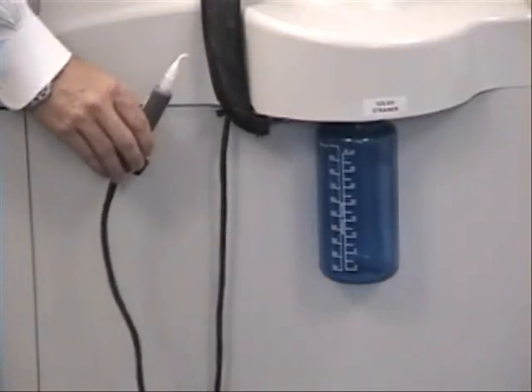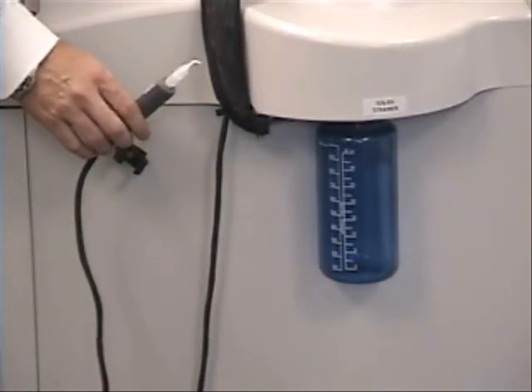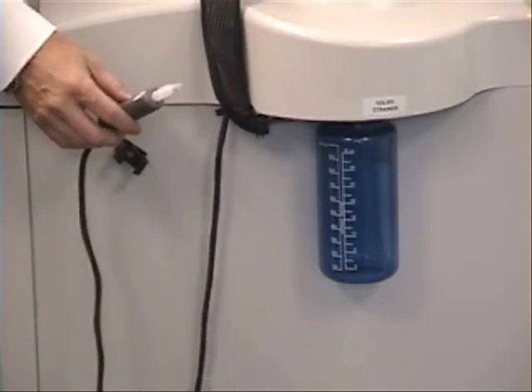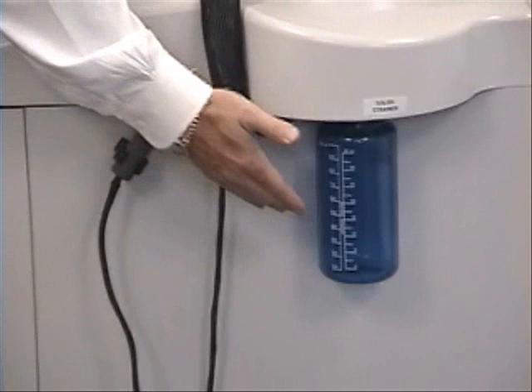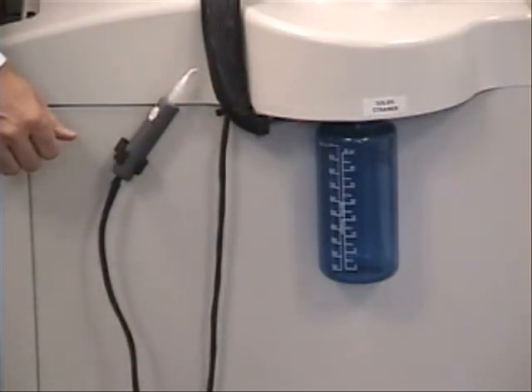The optional integrated shaft rinse wand provides an easy and convenient method for rinsing the shaft and stirring element prior to washing the dissolution vessel. The removable particulate trap contains a 40 mesh screen to prevent the build up of sediment in the waste tank.